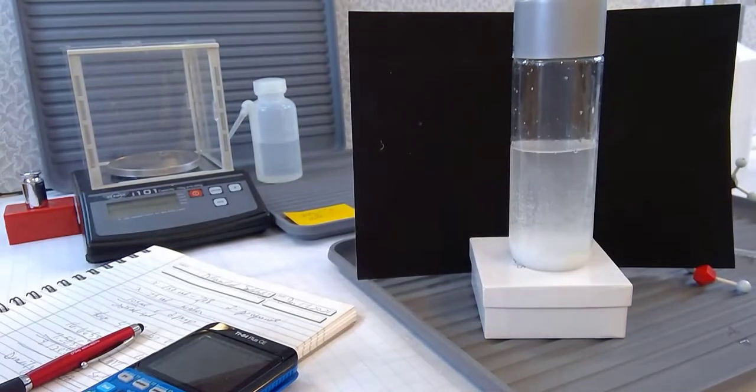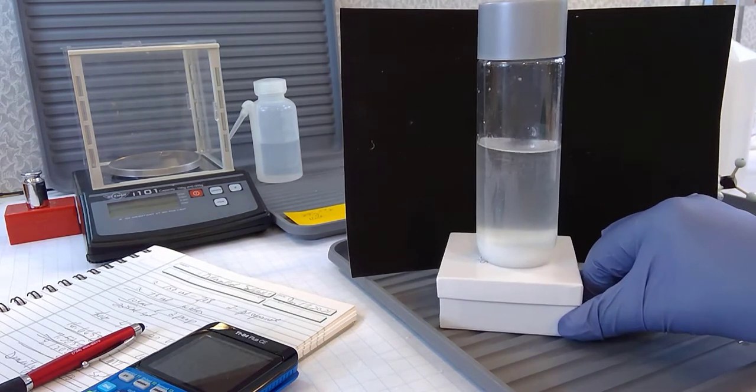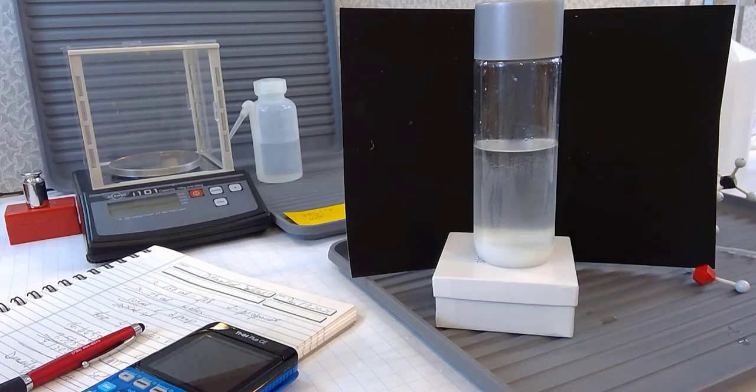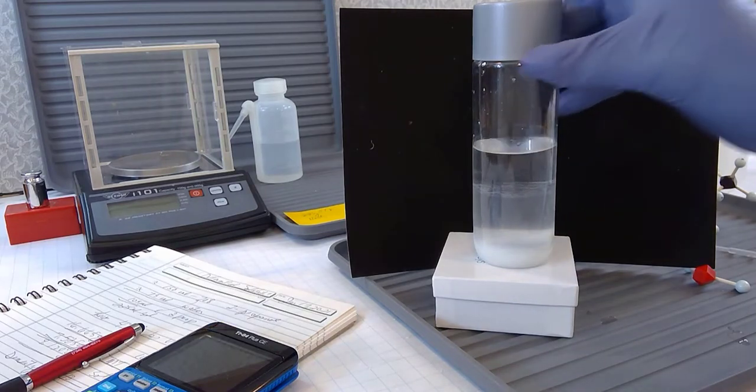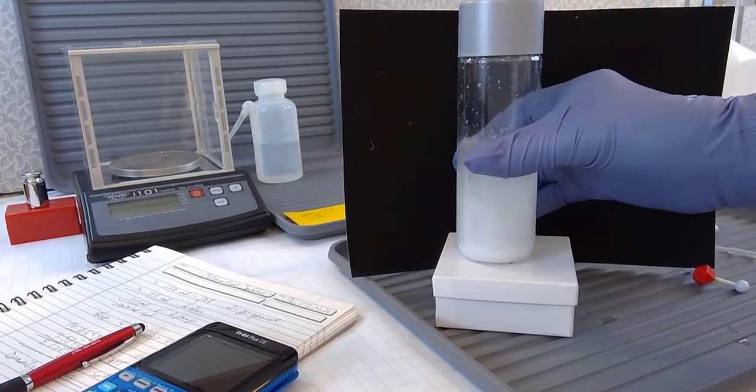So there we go. Now I'm going to move it over just a touch so you can see it better. And we're going to give it some time lapse. I'll shake it a few times in between, and then we'll come back to it. I'll fast forward through the time lapse to see what ends up happening with this intermolecular competition. Here, shake it up some more and give it a few minutes.